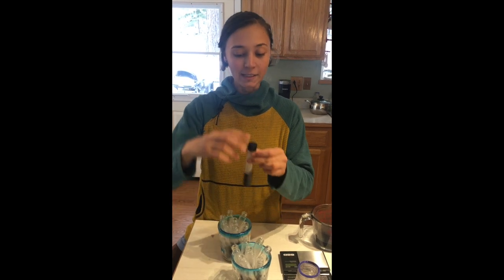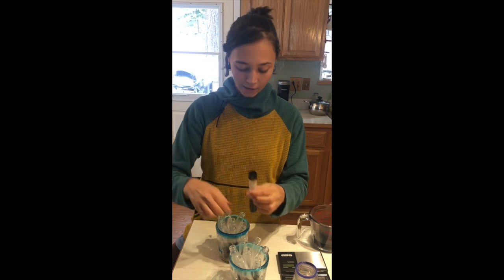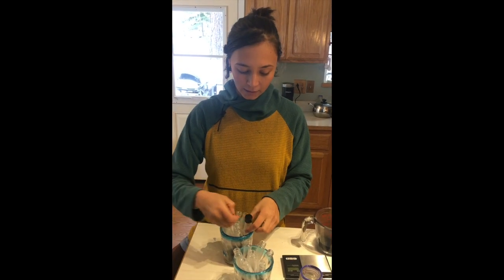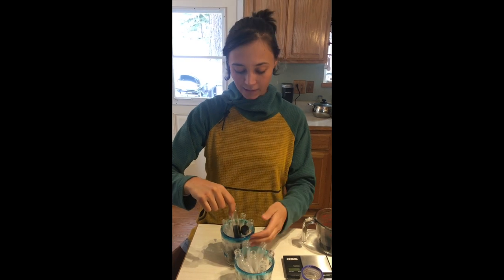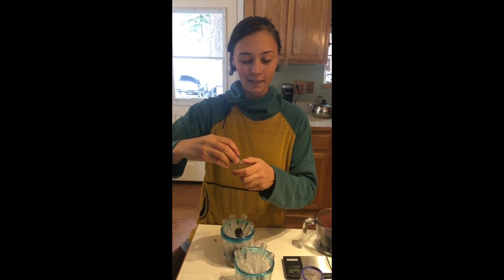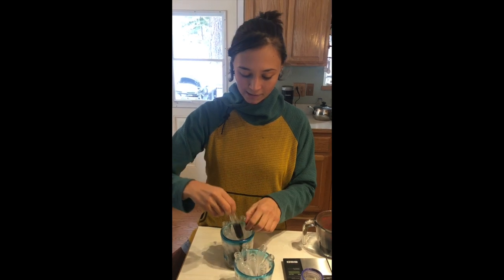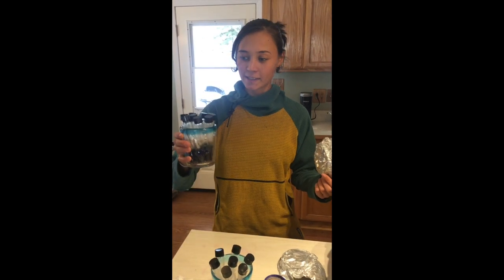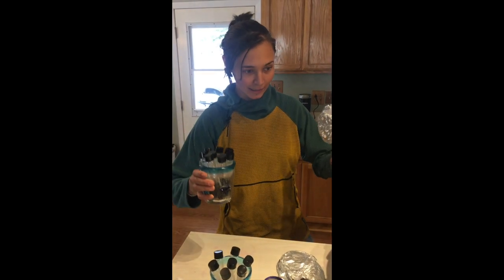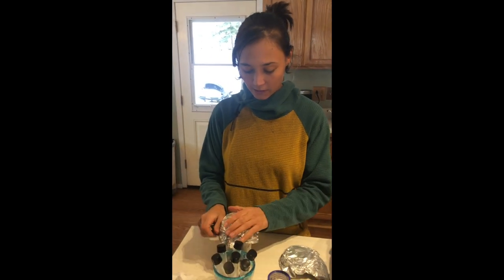Now I'm gonna place caps back on all the test tubes. I am NOT going to screw them on tightly — I'll screw them on and then crack them open a notch. That allows the contents inside the test tube to be sterilized. You don't want too much pressure building up in there while it's sterilizing — that could be a bad time. All caps are on quite loosely.